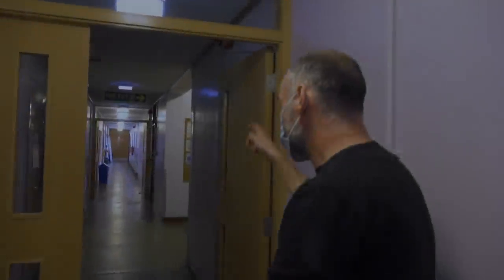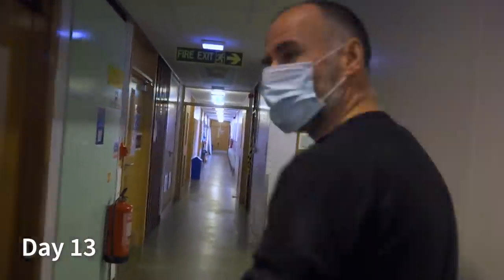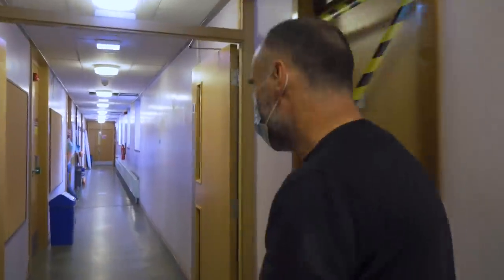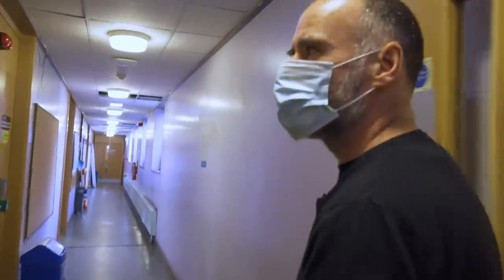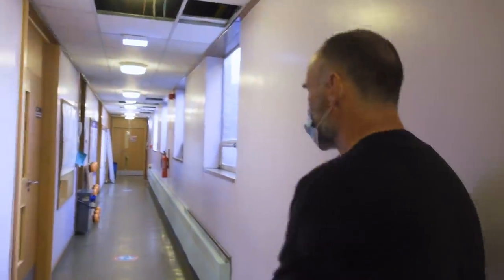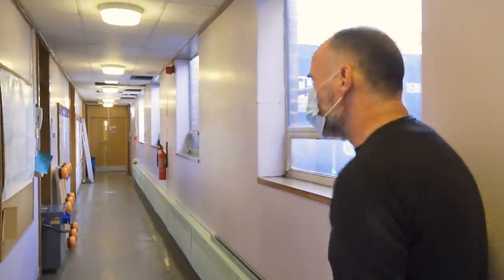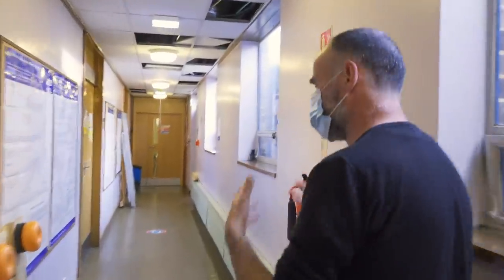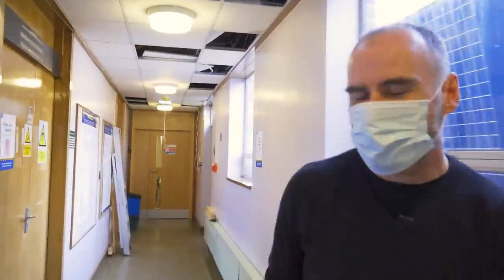So we are going just down to see the microscope now. We're at day 13. Thomas has now left to go back to Germany. Thomas and a Japanese engineer, from the company that supplies the instrument, a company called Unisoku, will be back on the 15th of November, when we'll start. The system will be at a good vacuum at that stage.